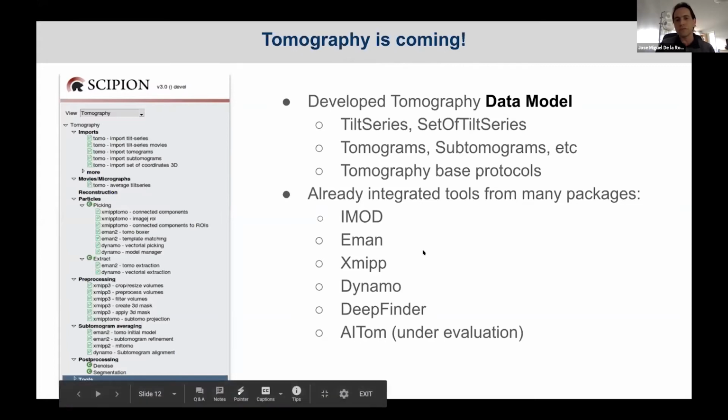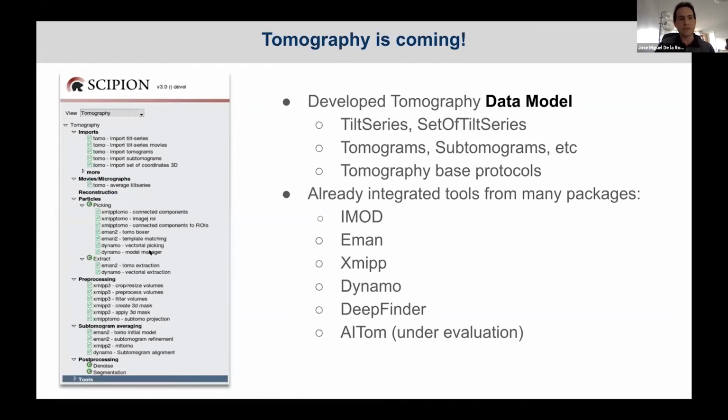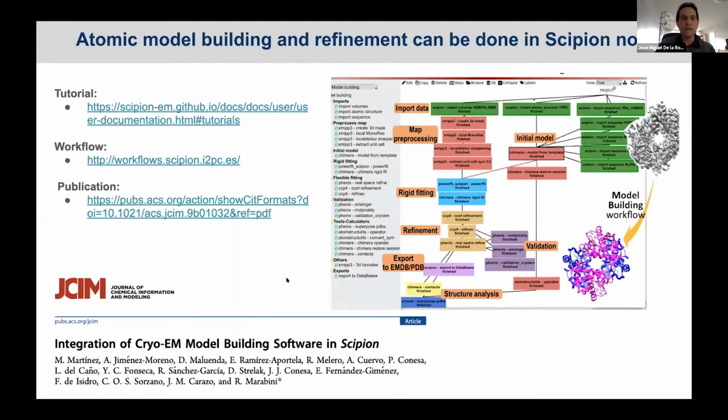So we have tools for IMOD and many other things. So keep an eye on the new release, where you will have a whole workflow, as you see here in this image, for tomography processing.